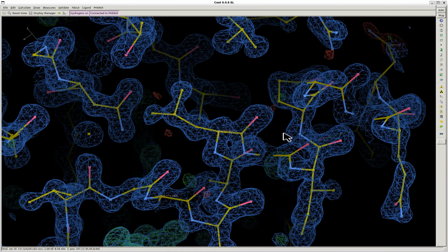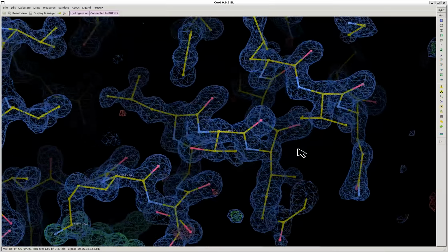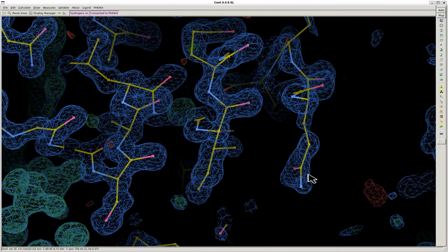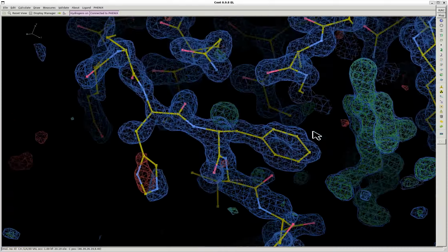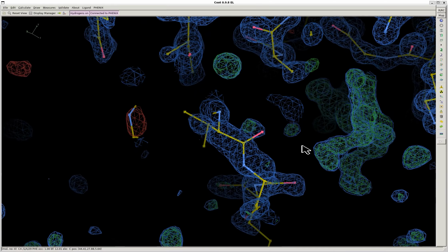And then just go through refining each of these segments one by one. And then when you're happy with all of the ones, and this is just a little demonstration of a couple.